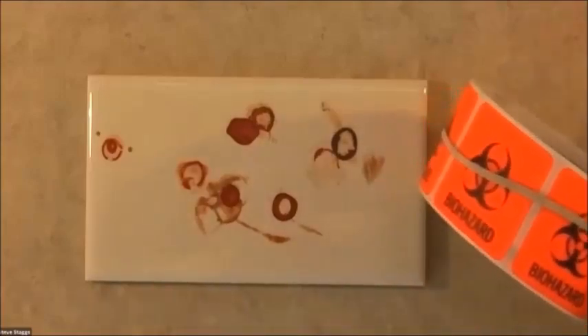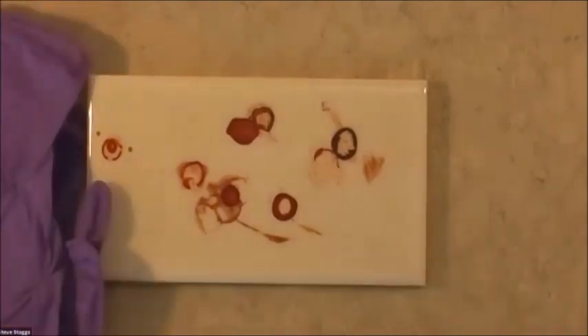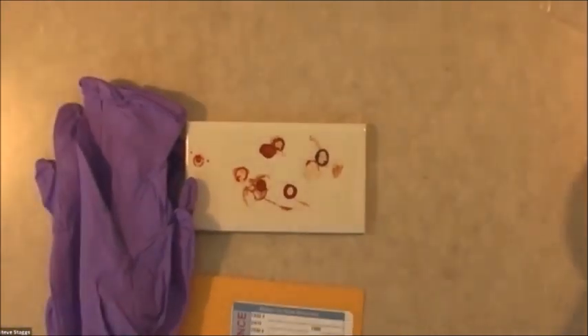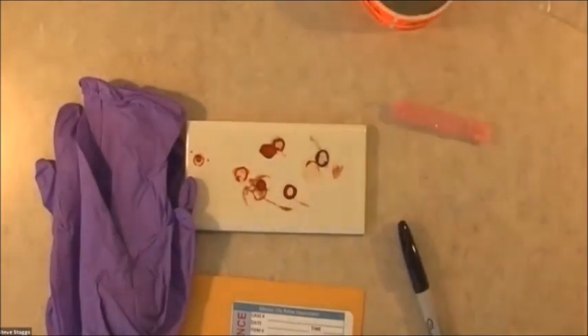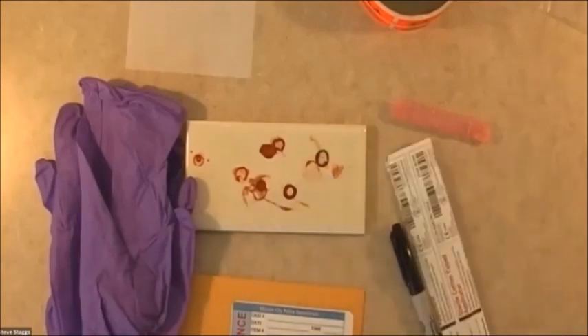You also have a biohazard sticker. You've got two pairs of gloves. You've got an envelope. You have a little container of distilled water. You have a piece of bindle paper. You've got a couple of swabs. And some evidence tape.